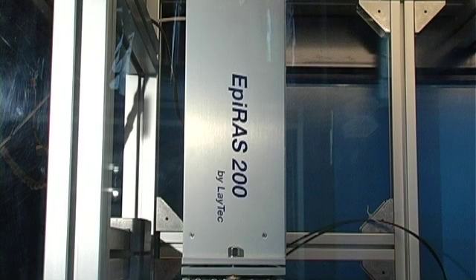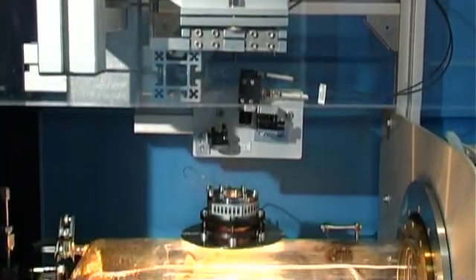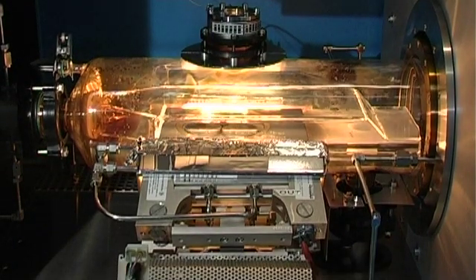Here you see the EPI-RAS installed above a research-type MOVPE reactor. It measures both the reflectance and the reflectance anisotropy of the growing layers spectroscopically. The method is so sensitive that you can actually see the monolayers grow and even identify the orientation of the atoms on the semiconductor surface.